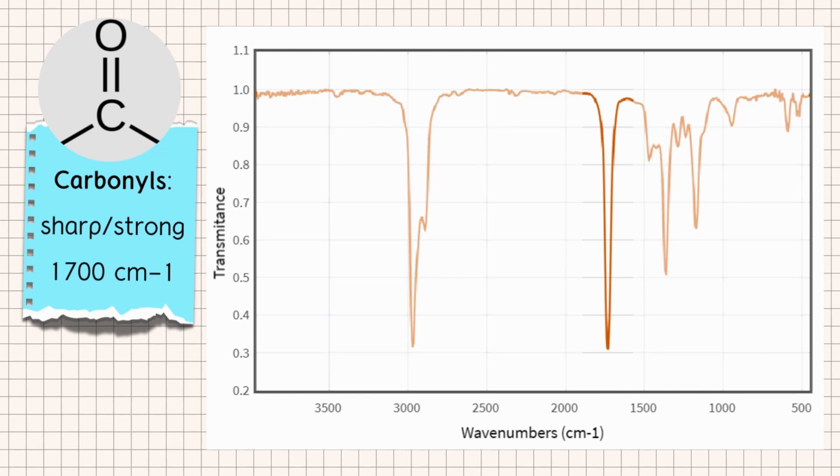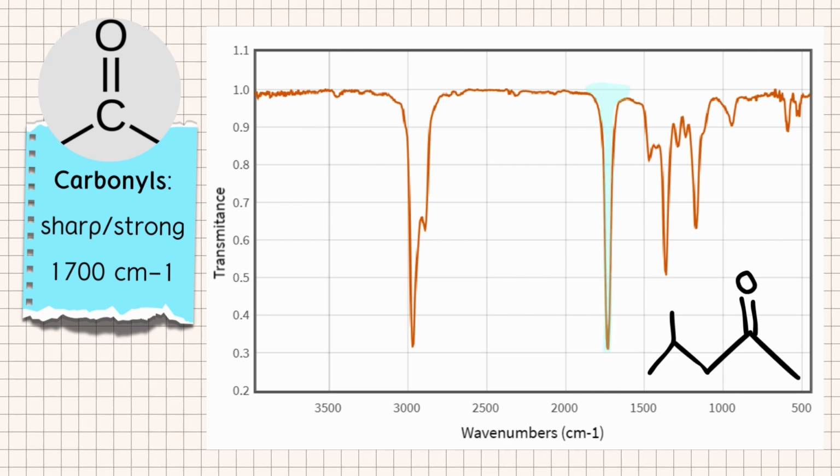Here's the full IR spectrum for this real molecule example. So that ketone gives that sharp peak there. Note that there's going to be a lot of mess around the signal of interest or other groups to determine, but you'll be able to hone in on the group you need to identify the molecule.